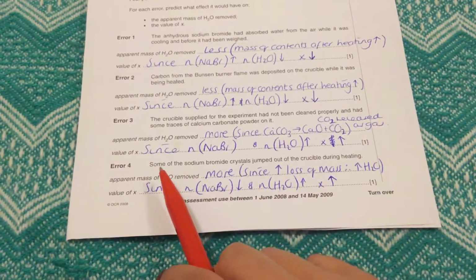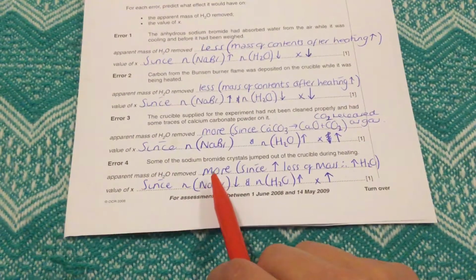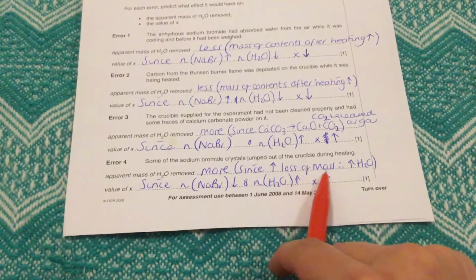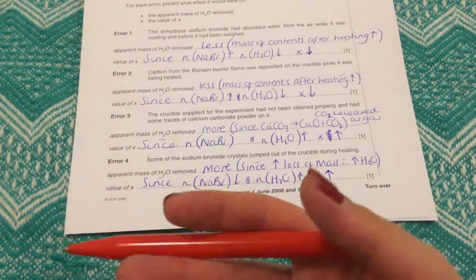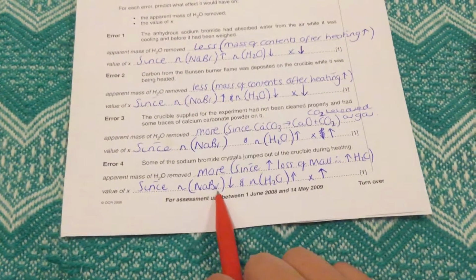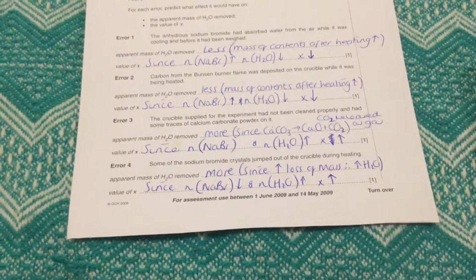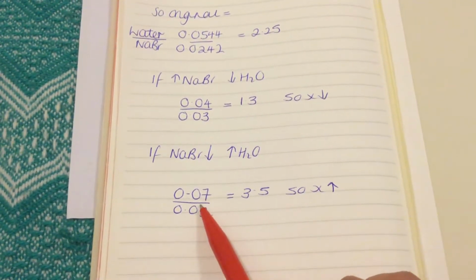With this one here, some of the sodium bromide crystals jumped out of the crucible during heating. So here, if we have got a greater loss of mass because some of the crystals are being removed, we assume that that loss in mass is due to water. Therefore, more water appears to have been lost, even though it isn't really. This means again that our number of moles of sodium bromide apparent will decrease and our number of moles of water apparent will increase.